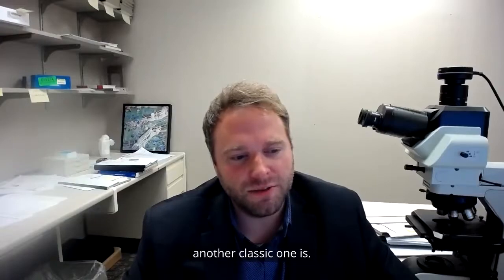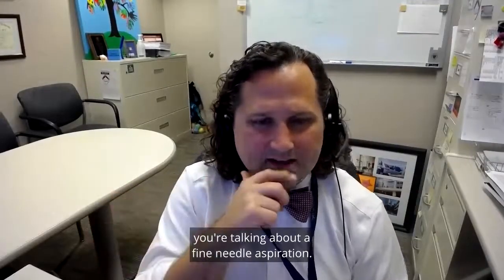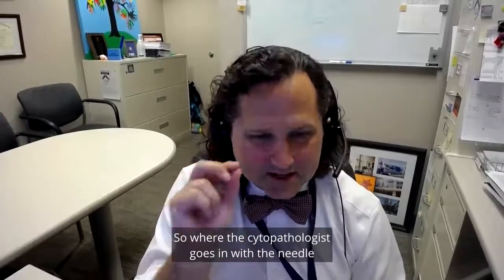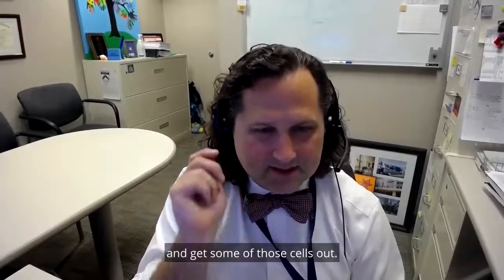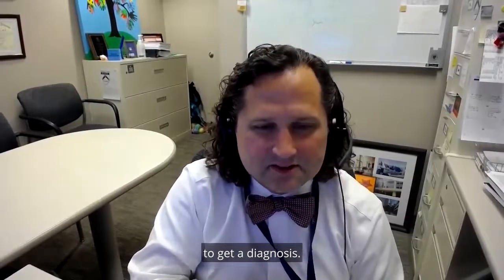Another classic one is... I'm sorry to interrupt. You say FNA, just to highlight for our audience, you're talking about a fine needle aspiration. So where the cytopathologist goes in with a needle and gets some of those cells out, exactly what you've been talking about, to get a diagnosis.